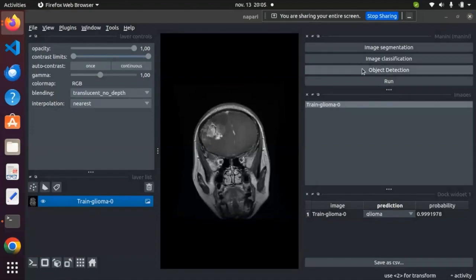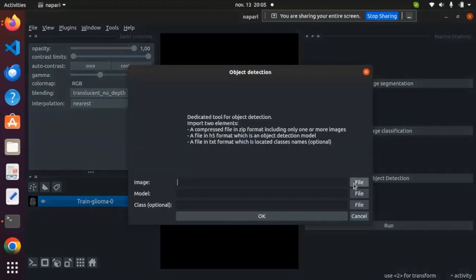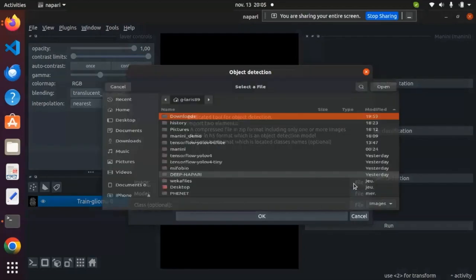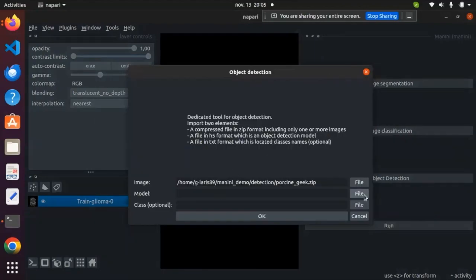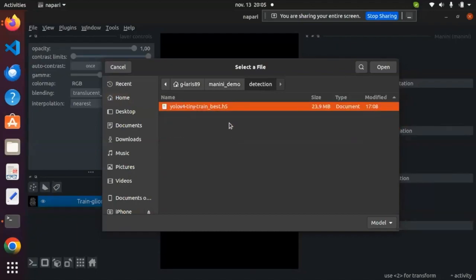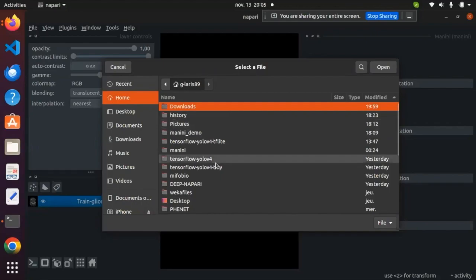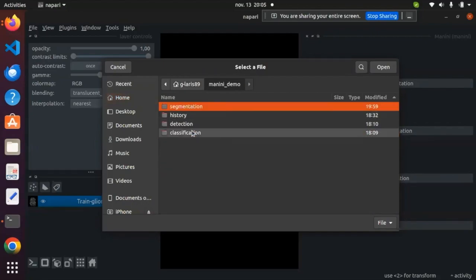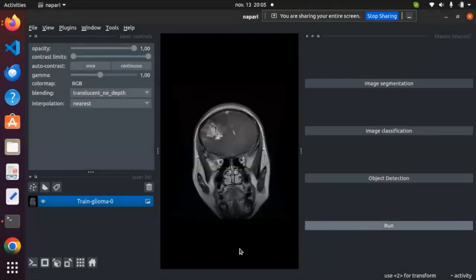Now for object detection — I remove the previous results and go to the object detection tool. I input the image and the model. The algorithm that Manini plugin accepts is the YOLO algorithm. Here it is YOLO v4.